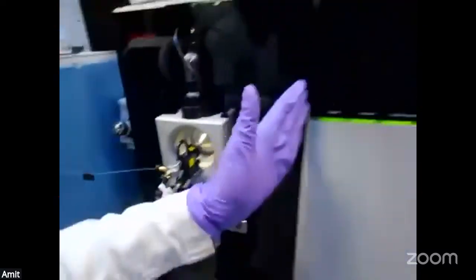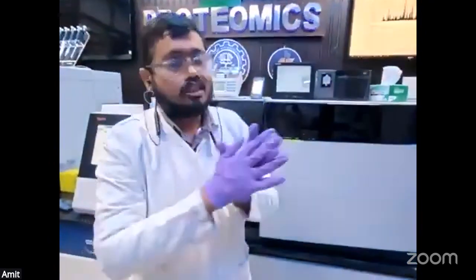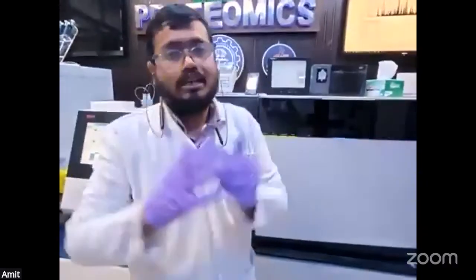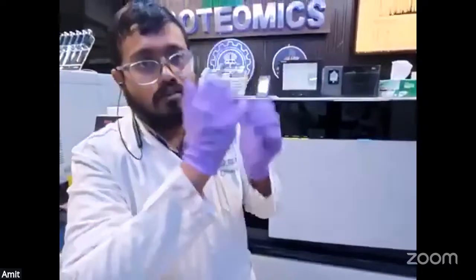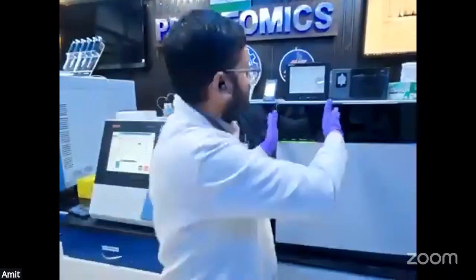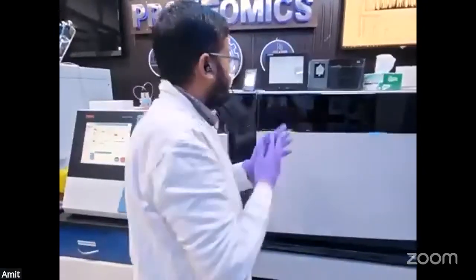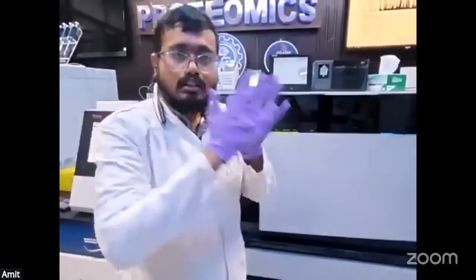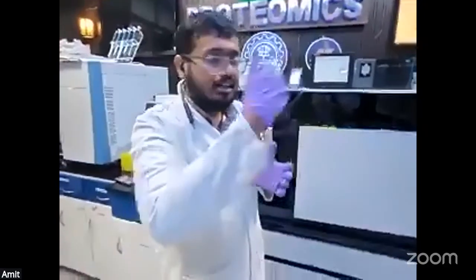Now we talk about LC-MS/MS, the tandem mass spectrometer. MS/MS means there should be two mass specs, because we want to get the sequence of the amino acids that are there. This instrument has three mass analyzers. One is the quadrupole, which we use to segregate the first precursor ion, the first window, where we are filtering it out.